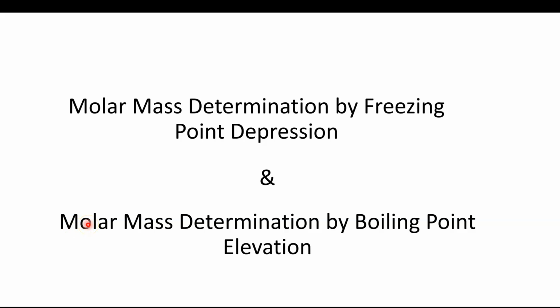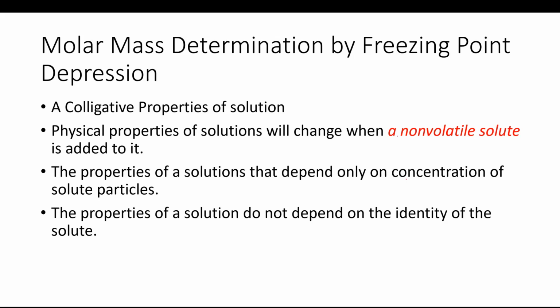This video is for the pre-lab for the molar mass determination by freezing point depression and molar mass determination by boiling point elevation. Both of these properties are what we call a colligative property of the solution.